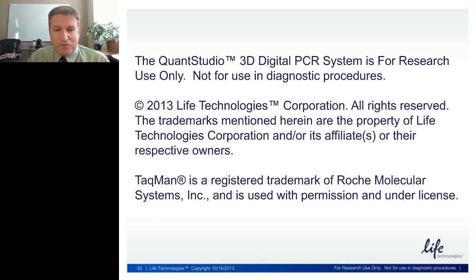It is basically performed in a real-time PCR tube in a volume similar to a real-time PCR assay. What happens in that case is that you're amplifying everything, but the ability to detect the wild-type allele is inhibited. So at some point, all you're detecting is the mutant locus. You're decreasing the signal from the wild-type and only having the mutant locus detectable.